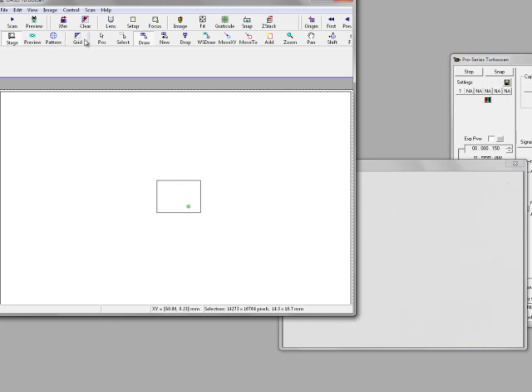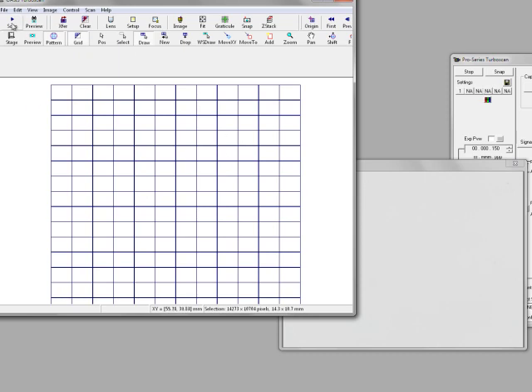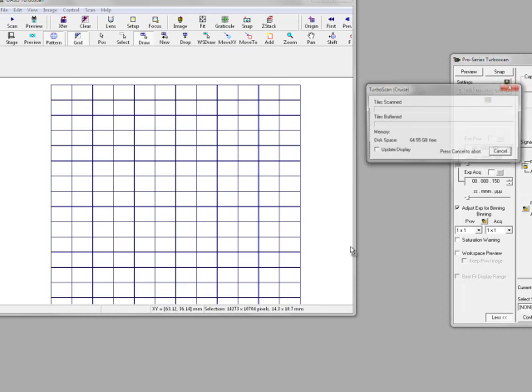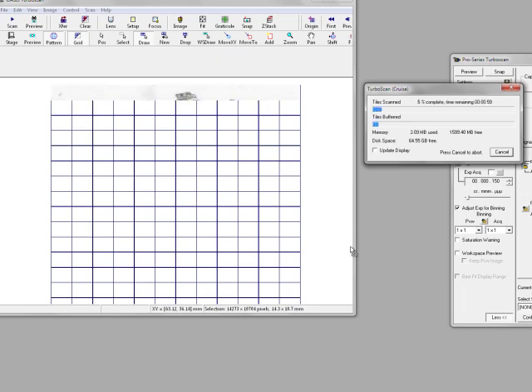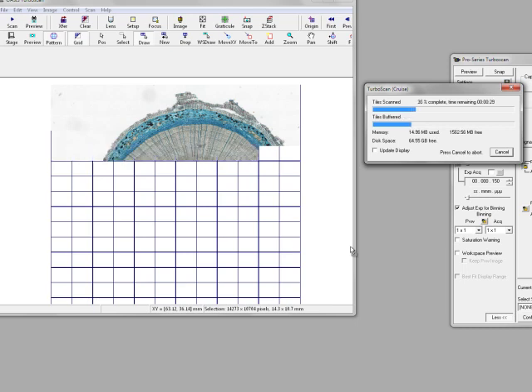So now I can actually put on here the pattern. We can actually see the grid and the pattern that we're going to scan. So now I just press scan. Now I'm just going to go and scan this area. And you can see it scans at quite some incredible speed. Each one of those little blocks represents a field of view, and we know that we're used to scanning one of those in a classical system about once every 3 to 4 seconds.